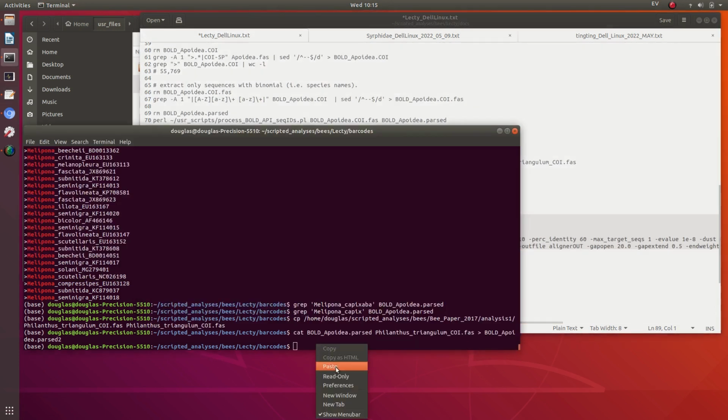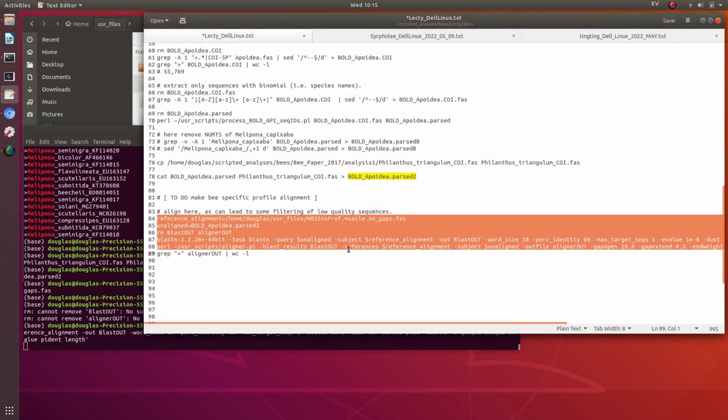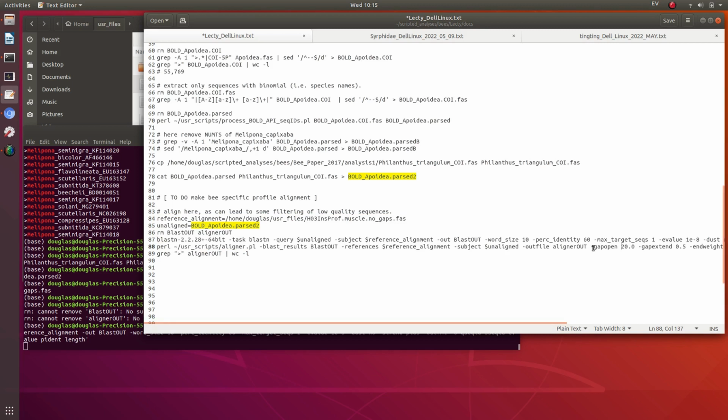get on with this. So BLAST search followed by parsing the BLAST results and for each hit doing pairwise Needleman-Wunsch alignment, which is global alignment. And these values, you need gap parameters. I optimized this some time ago, so these should be okay.